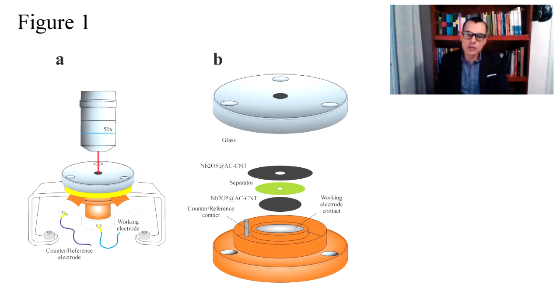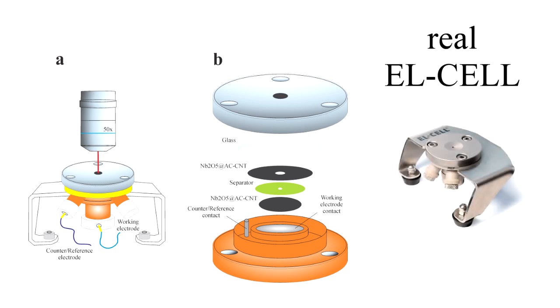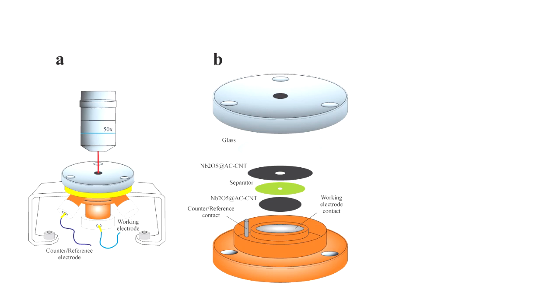In addition, using a hospital syringe with a small portion of the electrolyte, excess air was removed and some additional electrolyte added. As you can see in figure 1, figure A represents an EO cell overview looking inside of the Raman spectroscope, and figure B shows an internal view showing the electrochemical cell composition used in these operando experiments.